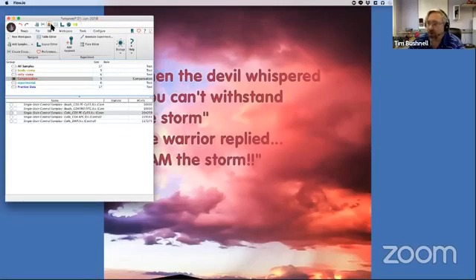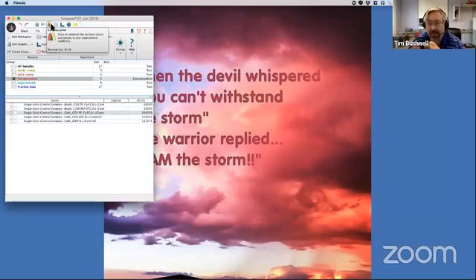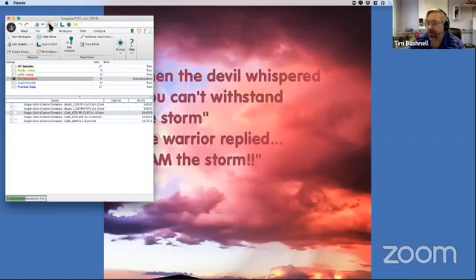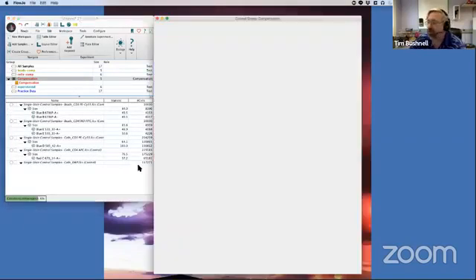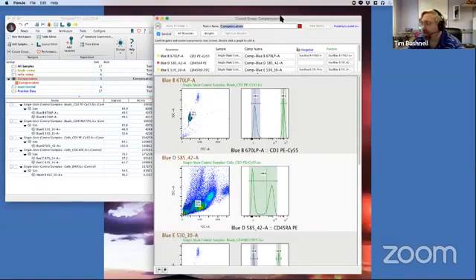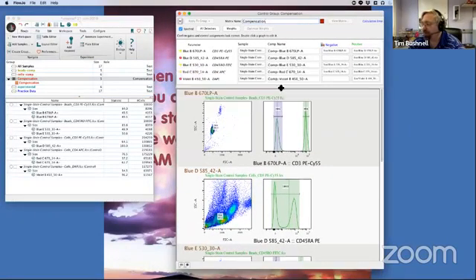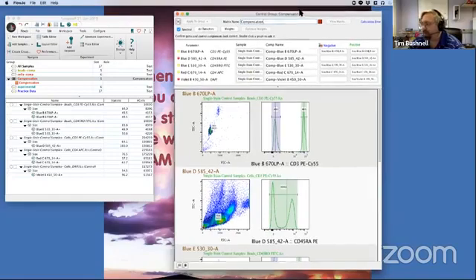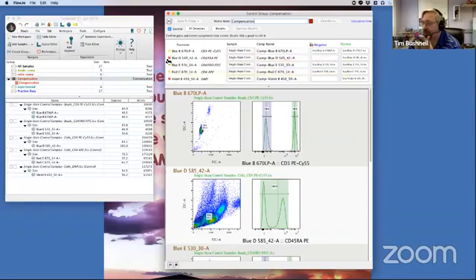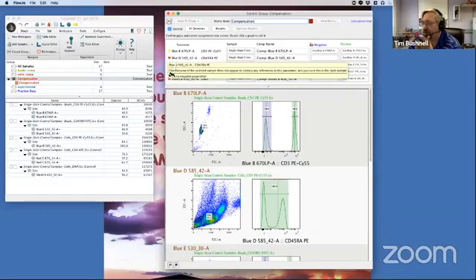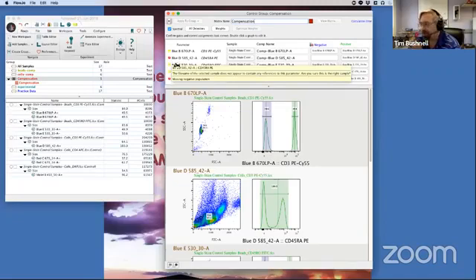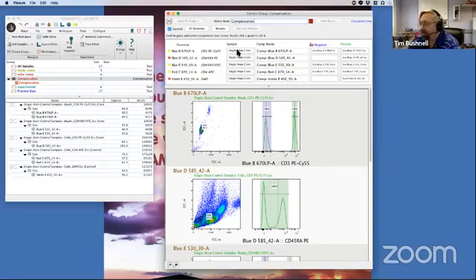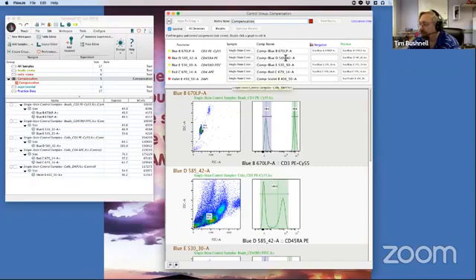Now, I can go and automatically use the wizard here. The wizard is now going to automatically attempt to identify my target carrier and then identify a positive and negative. And let's show you what that looks like. When I click on this button here, you'll see it's calculated the compensation matrix. And here it shows us the matrix. So let's draw this down here. Now, you'll notice in FlowJo, we have what's a green, yellow, red here. You can see these two buttons. There are issues. So we're going to definitely take a look at that. It's going to tell us what it thinks each of the parameters is measuring, what the compensation is. And then we're going to see our positive and negative.